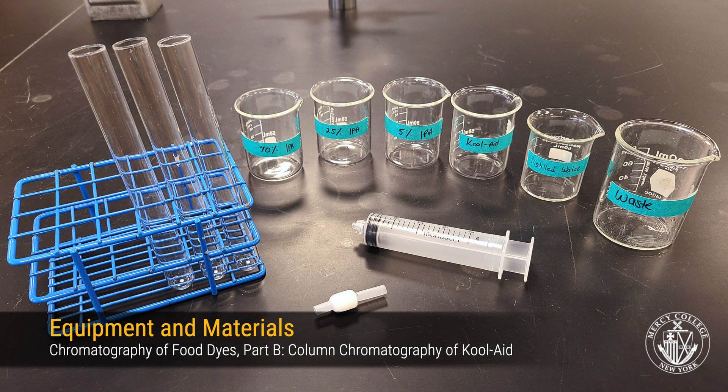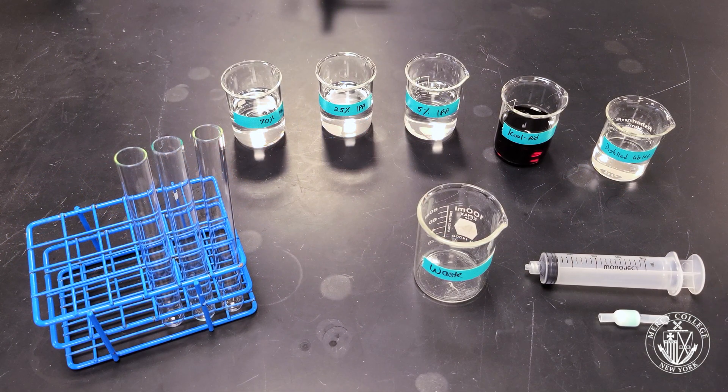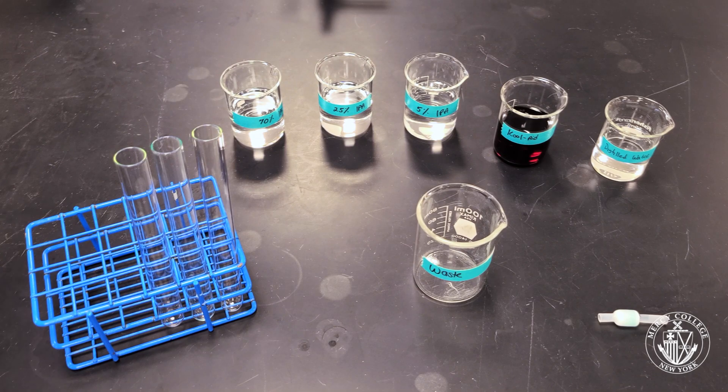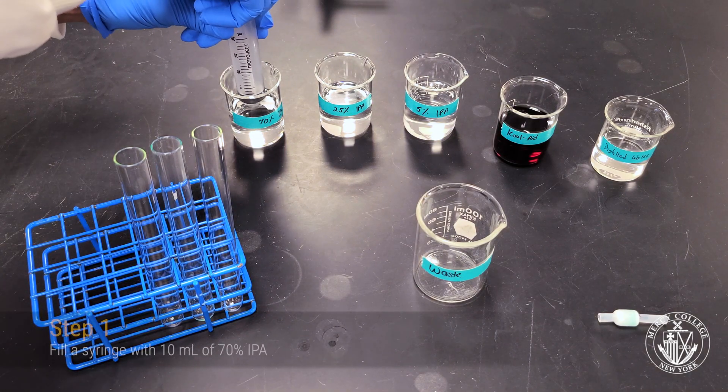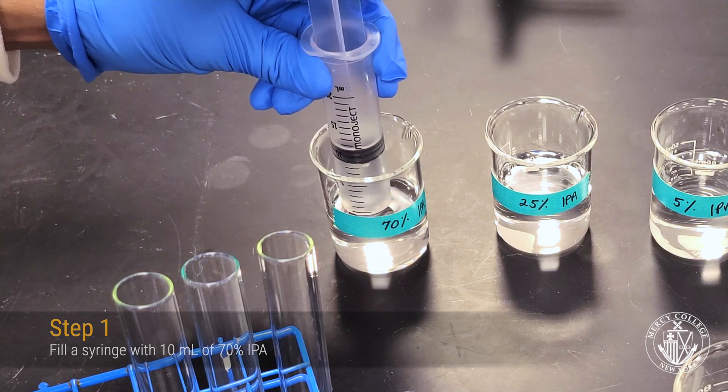Here are some materials that we're going to make use of in Part B of the experiment. Step 1 is to take your syringe and fill it with 70% isopropyl alcohol. We're going to use the isopropyl alcohol to clean our column prior to use.